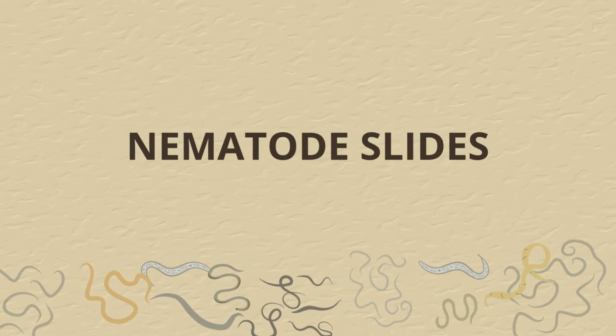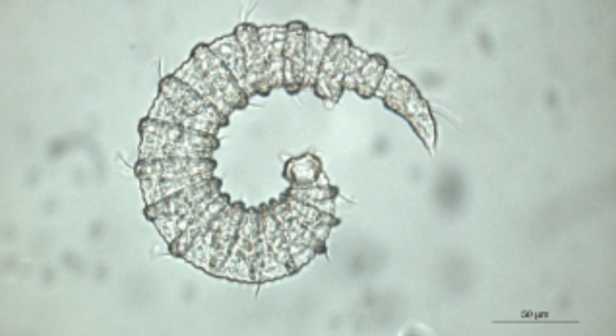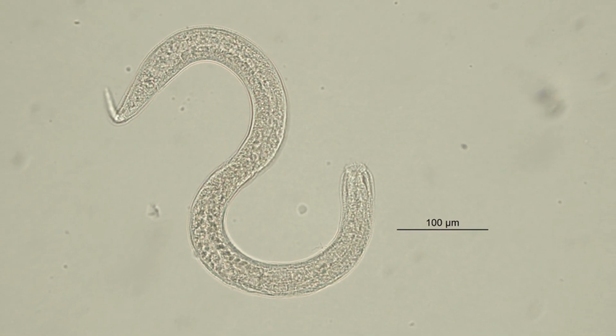Nematode slides. Nematodes are the most abundant organisms in marine benthic environments.